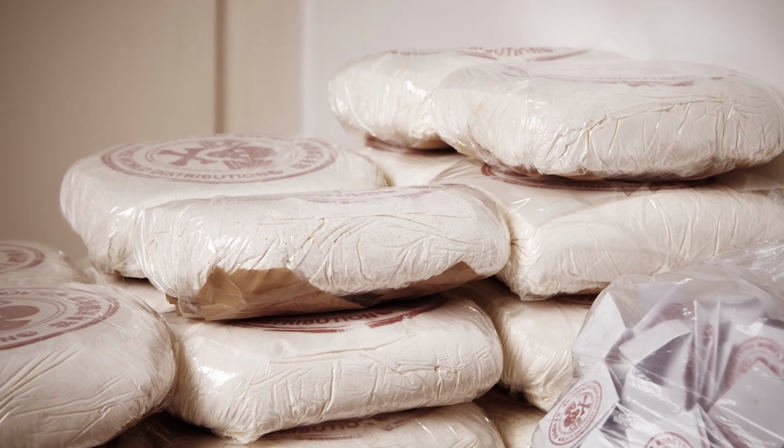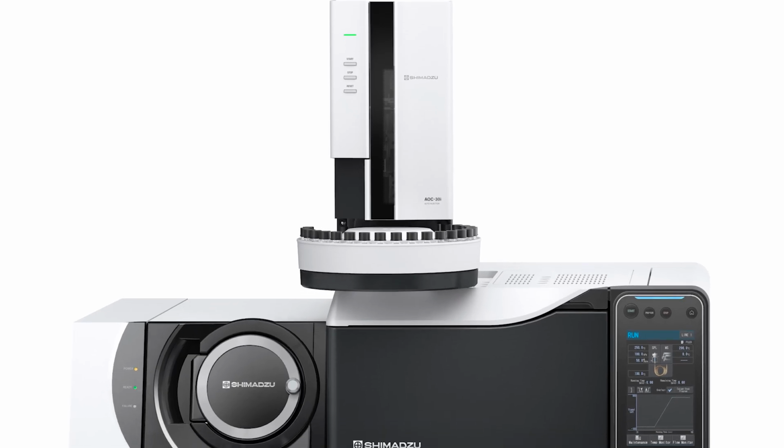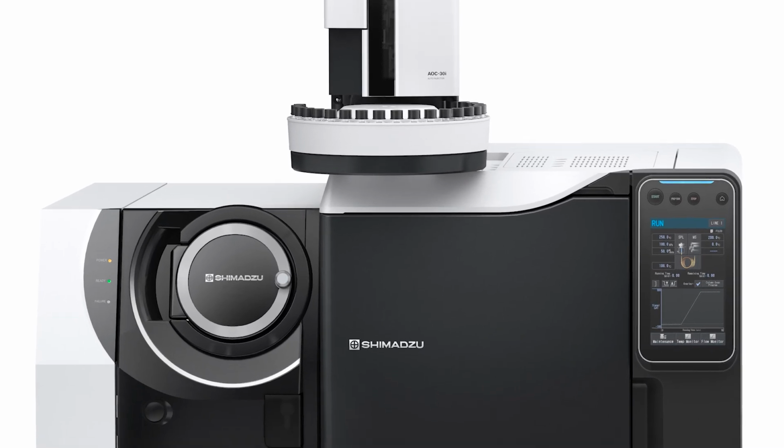For example, an FTIR is used to identify a suspicious white powder. Further confirmation testing of the substance is conducted by gas chromatography mass spectrometry. Each of these techniques utilize the unique chemical properties of the material to determine its identity. The unknown white powder is then compared to a known standard for confirmation.